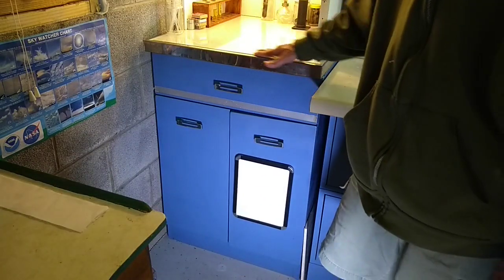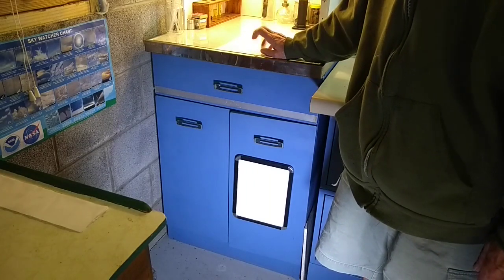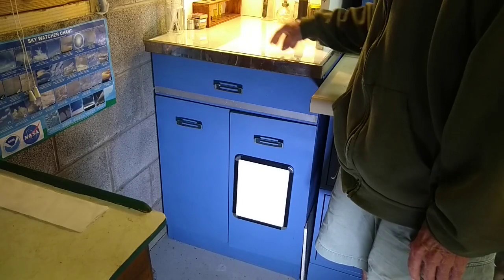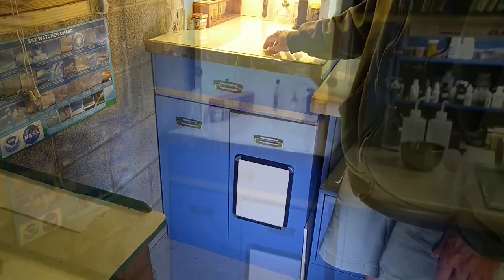On the top, it's actually Formica or something, and I have a sheet of window glass that I had lying around from a storm window. So I cut it to size, and that keeps the Formica from getting messed up.